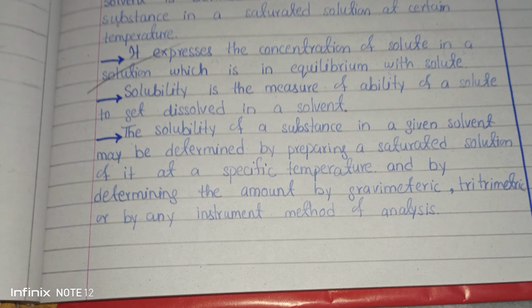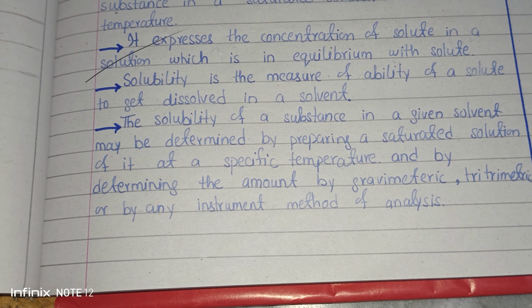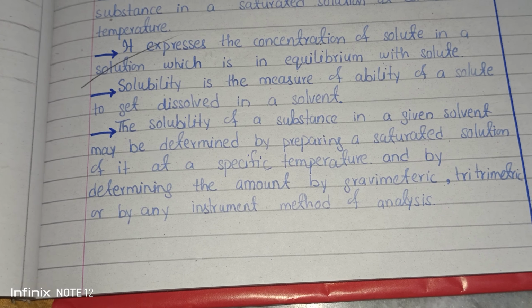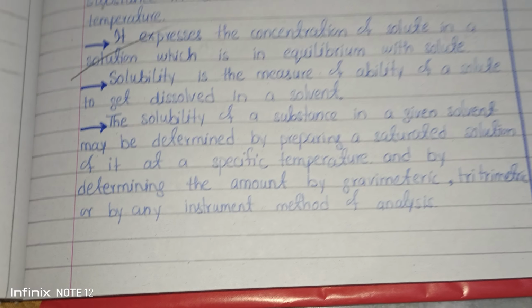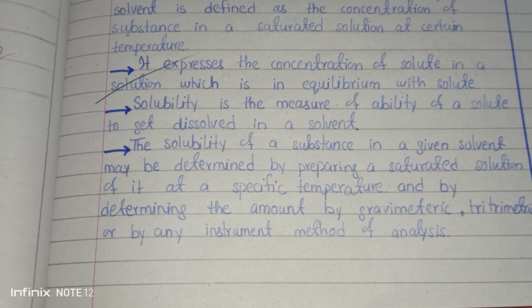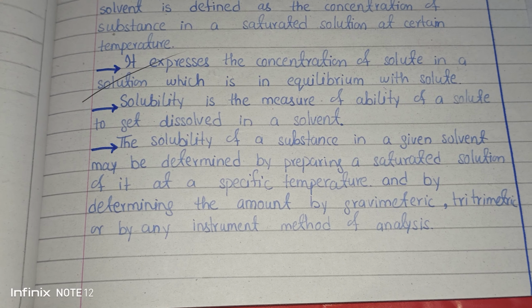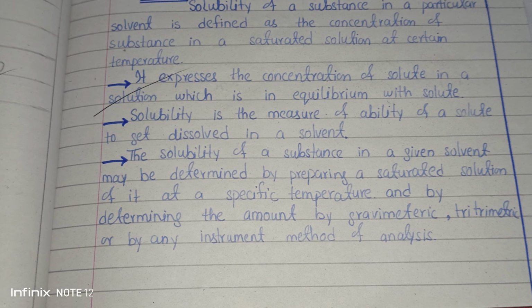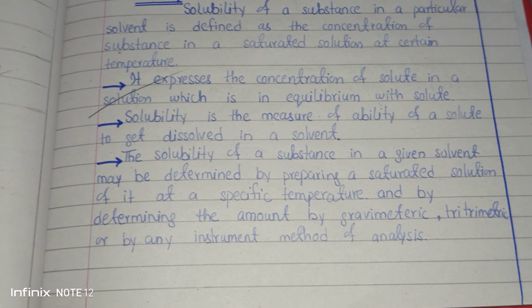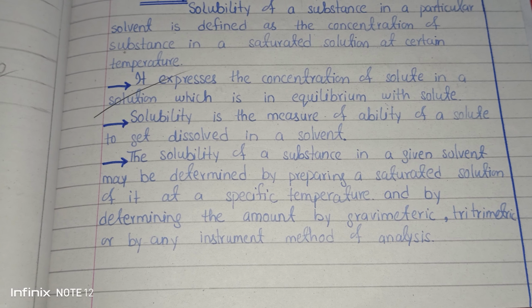You will add NaCl, stir and dissolve it until the sodium chloride starts to settle at the bottom of the beaker. Whenever the sodium chloride starts to settle down, this indicates that your saturated solution is prepared. In that method, you prepare your saturated solution.